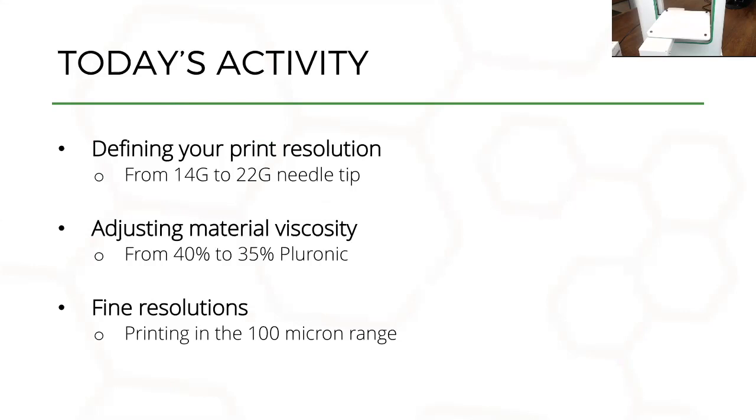And then finally, if you're looking at printing very fine resolutions, for example, going down to the 100 micron range, there are certain things that you also need to take note of, particularly the speed. So in today's demonstration, Oliver will show you how speed will make a big difference.